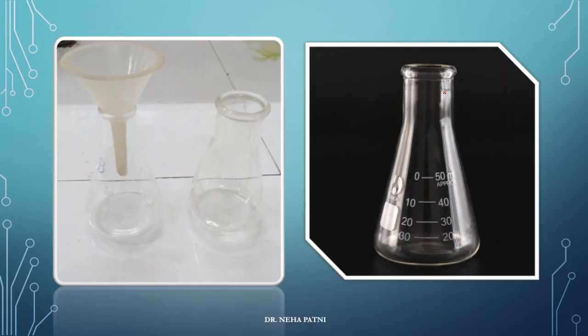This is nothing but a conical flask, and this is a funnel — which could be of plastic or glass depending on the solution. In titration, we do not prefer a beaker; we prefer a conical flask. We take the solution in the conical flask and from the top we use a burette to pour the solution. The reason is that the conical flask has a very narrow mouth, so when you continuously stir the solution, it is not going to spill out — whereas with a wide-mouthed beaker, it is quite possible that the solution would spill. So for a proper titration, we normally select a conical flask.